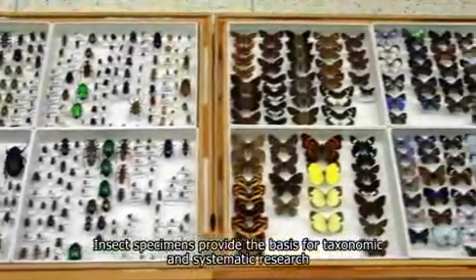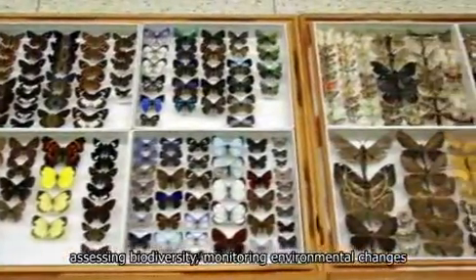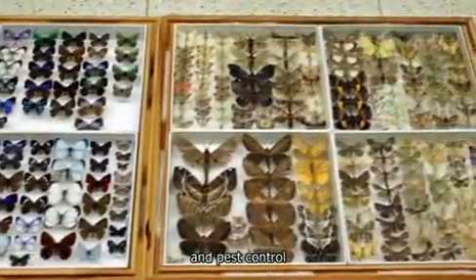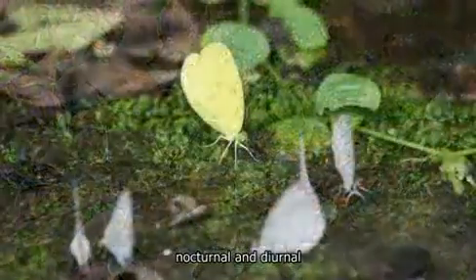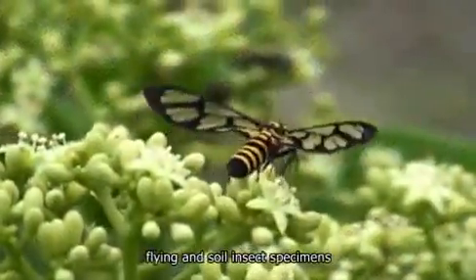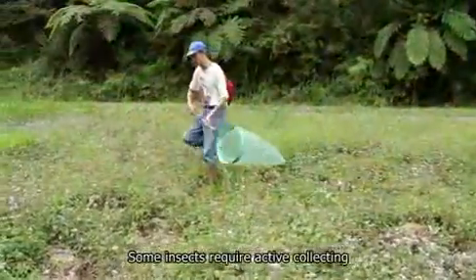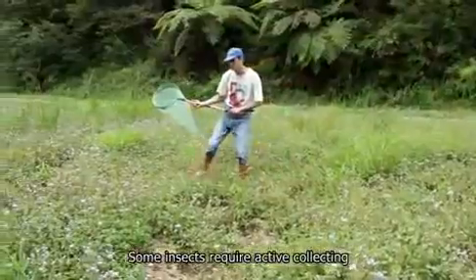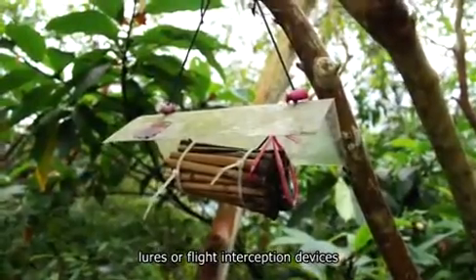Insect specimens provide the basis for taxonomic and systematic research assessing biodiversity, monitoring environmental changes, and pest control. A variety of equipment and methods have been developed to collect nocturnal and diurnal, aquatic and terrestrial, flying and soil insect specimens. Some insects require active collecting, while others are collected passively by traps, lures, or flight interception devices.